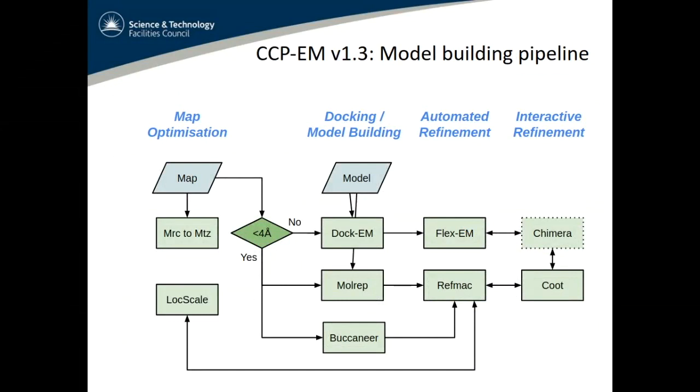With that, the title of this talk was Model Building and Validation in CCP-EM, so I'm going to spend most of the time on model building tools. And this is a flowchart with an overview of the main stages involved and the main tools for them.